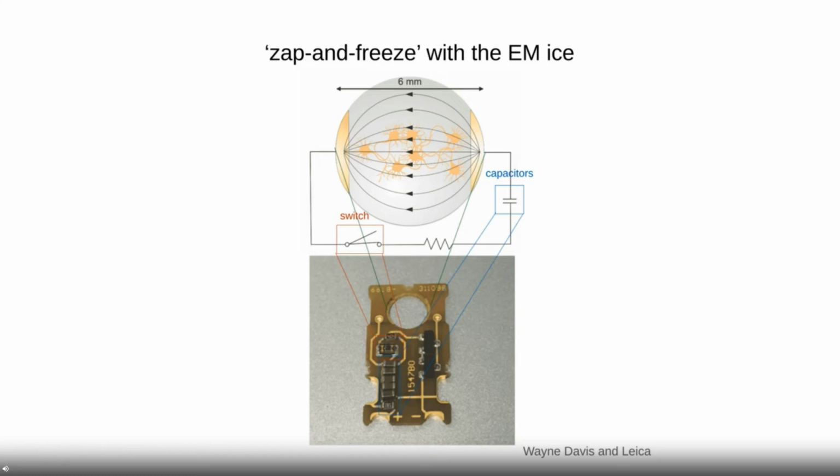And just a quick note here, all these things are very fancy and do seem like a real technical advance. But on the side of the experimentalist, it really doesn't add any extra difficulty to a high pressure freezing experiment. Really everything on my end is very much the same.